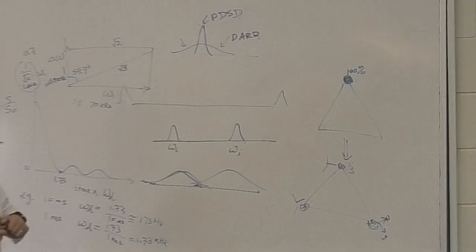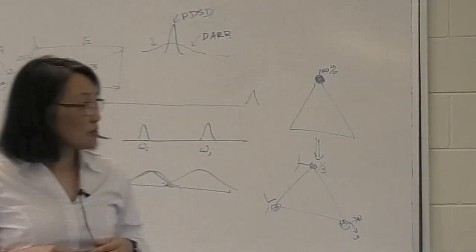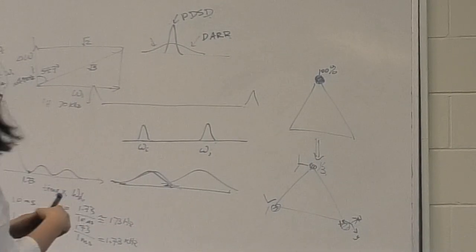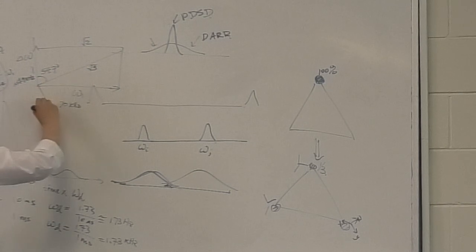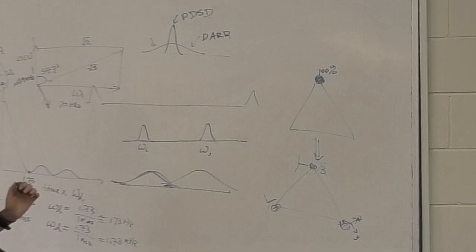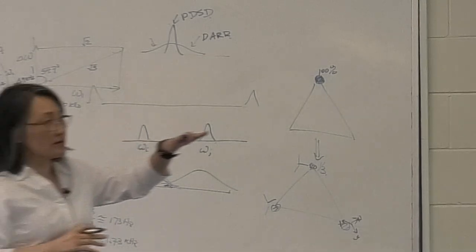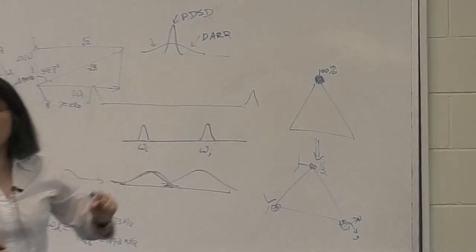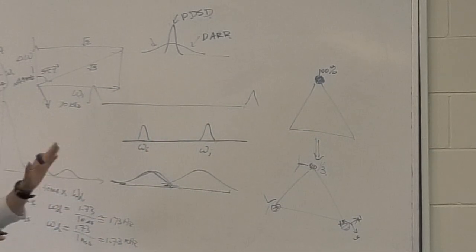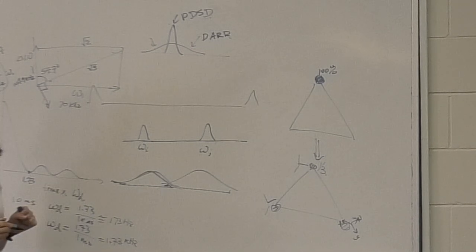And when you do that, if you want your homonuclear decoupling to work, your magnetization has to be 90 degrees from that effective field. So it gets very complicated. How do I do that? After I do my normal 90-degree excitation, putting things in the transverse plane, I have to give it another 55-degree pulse to put it in the right place in order to have this 90-degree relationship.